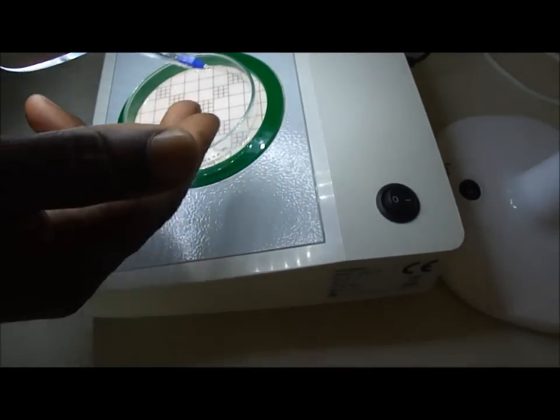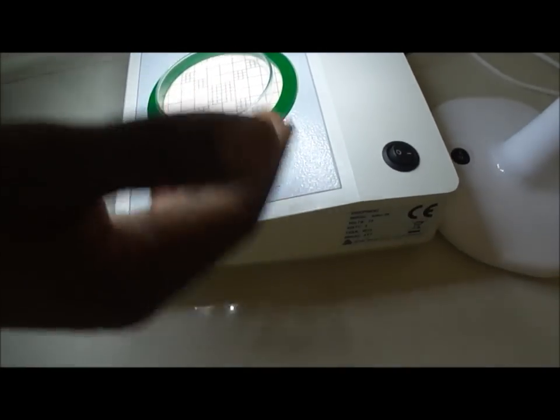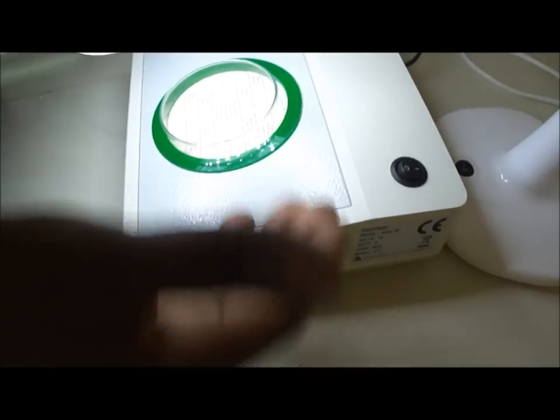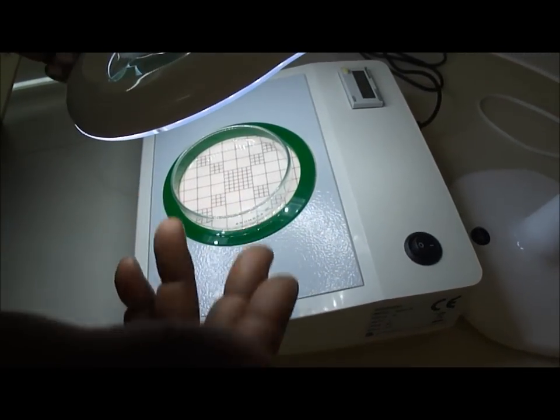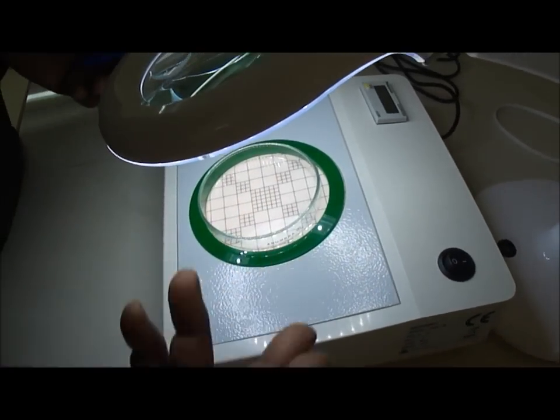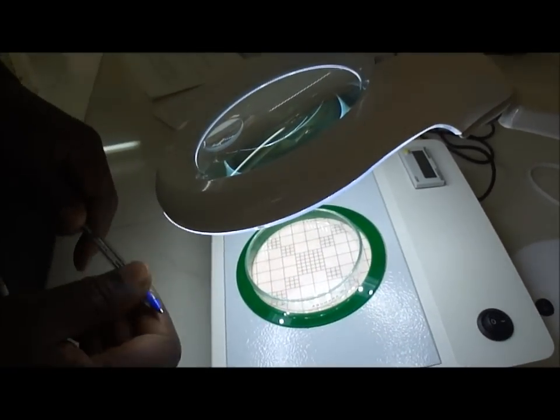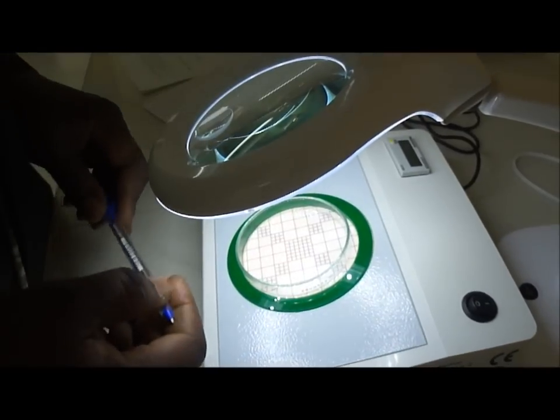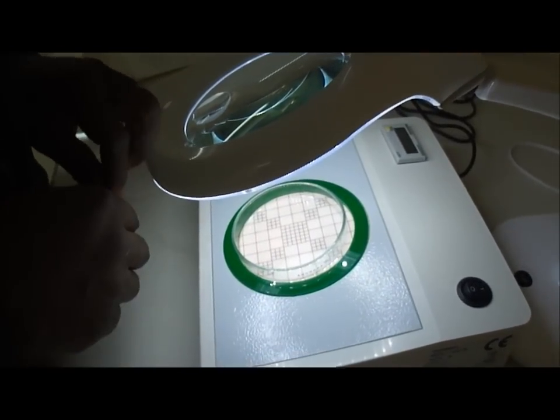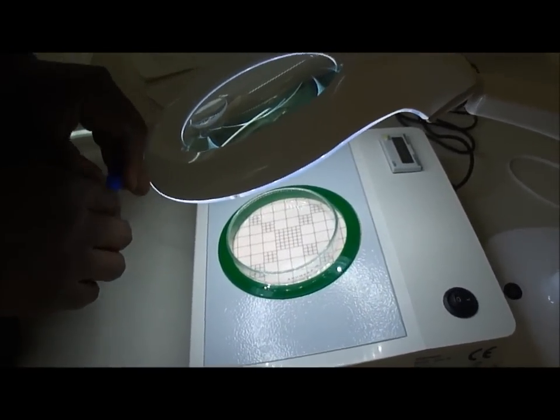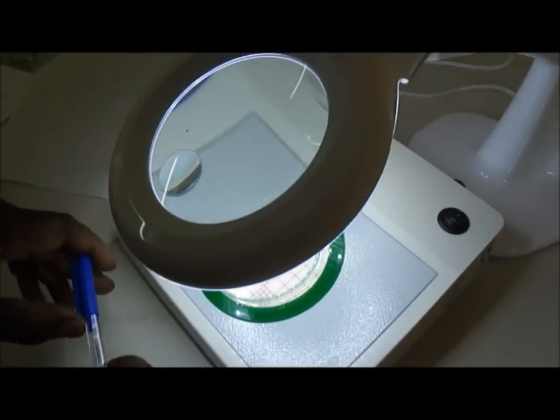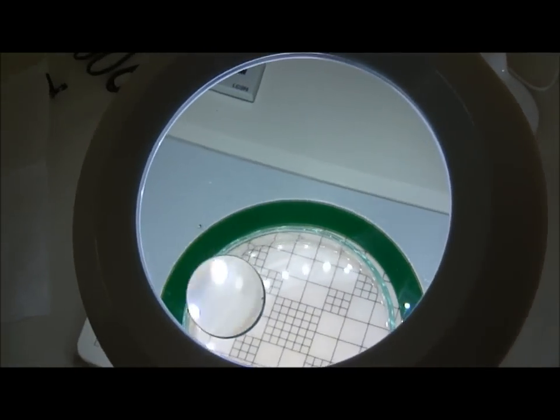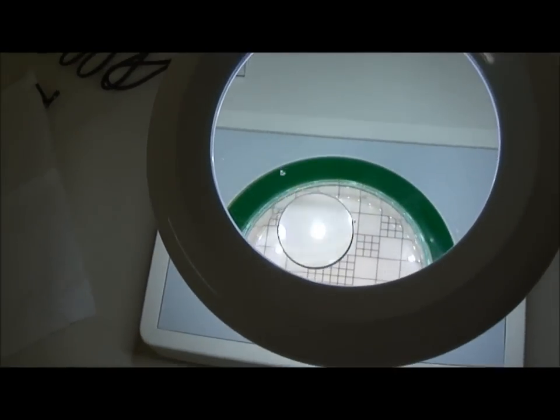And then, if you have the number of colonies here, you know that if the dilution factor was, for example, 100, you find that you have 10 colonies, then you multiply the 100 by 10 colonies, and then you have 1,000 in your original sample of bacteria, 1,000 bacteria in your original sample.